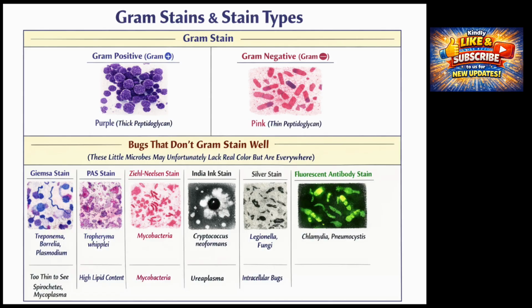Periodic acid-Schiff, or PAS, stain identifies carbohydrates such as glycogen and mucopolysaccharides, which are components of certain bacterial walls or the intracellular inclusions they produce. It is classically used to diagnose Tropheryma whipplei, the agent of Whipple disease, because PAS binds the glycoprotein-rich bacterial remnants accumulated in macrophages. This highlights how structural composition determines staining behavior and allows targeted diagnosis.